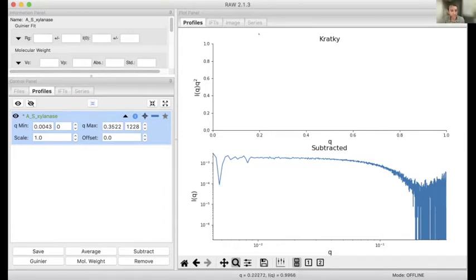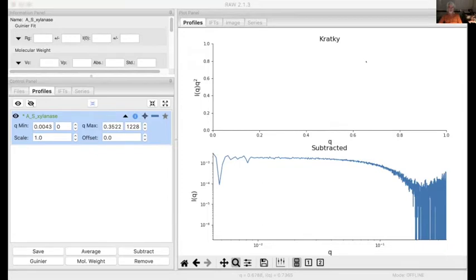Yeah, I think SIBYLS is in some ways unique in that they do a lot of processing for you. I guess BioCAT, I've heard, is doing a lot of that as well. If you come collect data at CHESS, you have to do it yourself. Yeah, we're not pipelined yet. But as soon as Jesse has worked out his technique, I think we'll adopt it and do more of that.